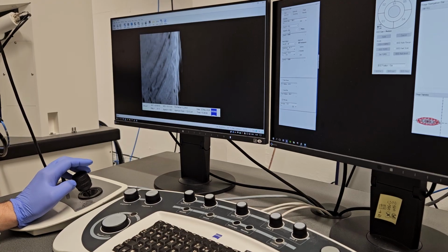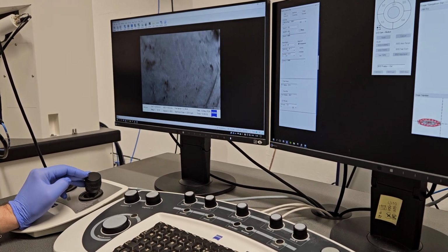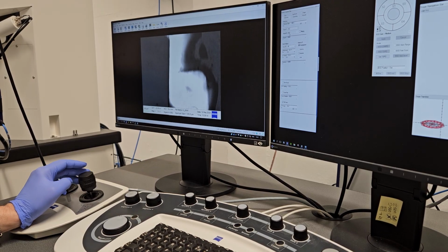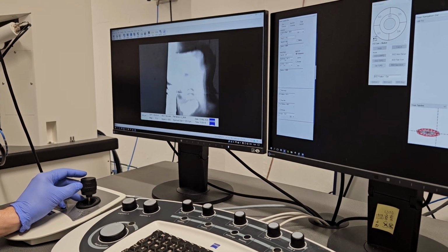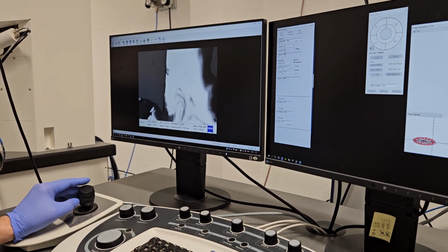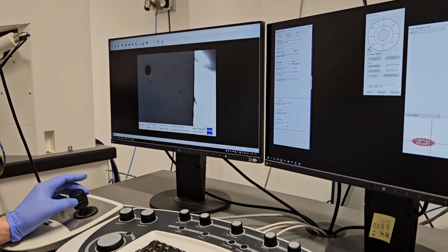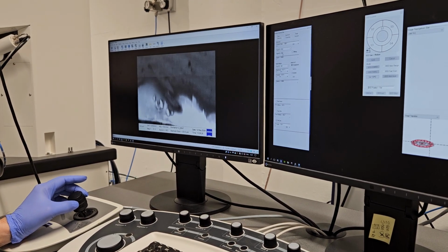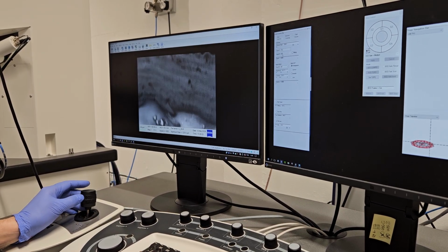One of them is close, one of them is away. Which one of them is close? I'm trying to find another sample. But you didn't try that direction. So another sample, it's the same sample. It's the color. This is the stage. Okay, there's nothing there.